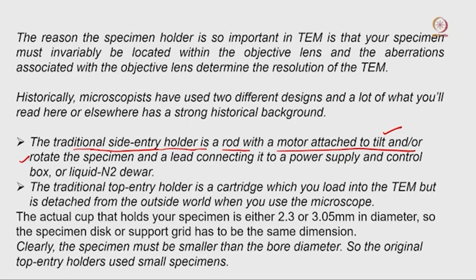Some holders you can use at liquid nitrogen temperature, where a liquid nitrogen dewar will be connected. There will be some holders with a power supply and control box, where you can heat the holder and see the morphology change of any material, and you can also change the position of the holder.